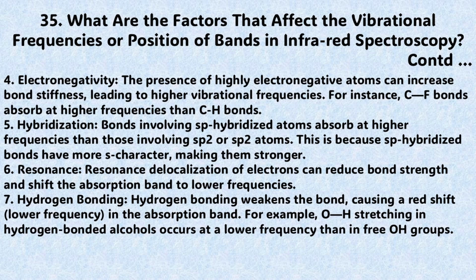Resonance. Resonance delocalization of electrons can reduce bond strength and shift the absorption band to lower frequencies. Hydrogen bonding. Hydrogen bonding weakens the bond, causing a redshift, lower frequency, in the absorption band. For example, O-H stretching in hydrogen-bonded alcohols occurs at a lower frequency than stretching in the free O-H groups.